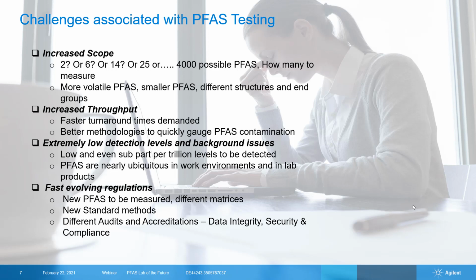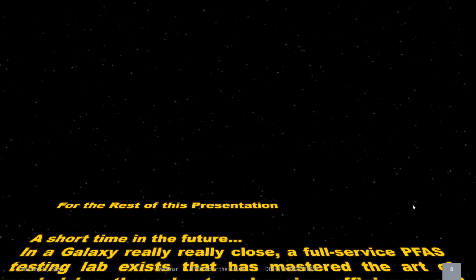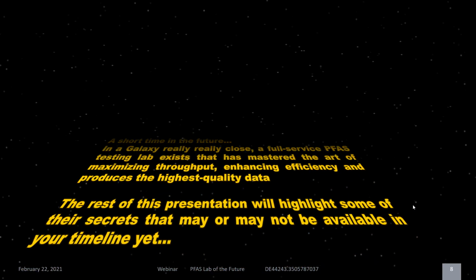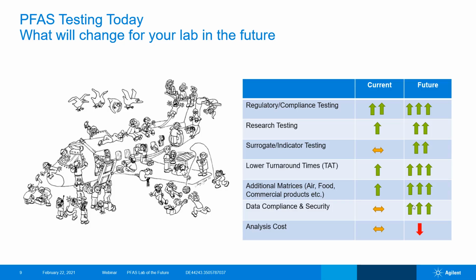So what we're going to do now is take a step into the future, and I want you to think about the lab of the future, and I'm going to talk about what this lab is going to be doing. So for the rest of this presentation, what I'd like you to think about is a short time in the future in a galaxy that's really, really close. A full service PFAS lab exists that has mastered the ability to get maximum throughput, efficiency, and quality of their PFAS analysis. So we're going to talk about this lab of the future that's doing PFAS analysis.